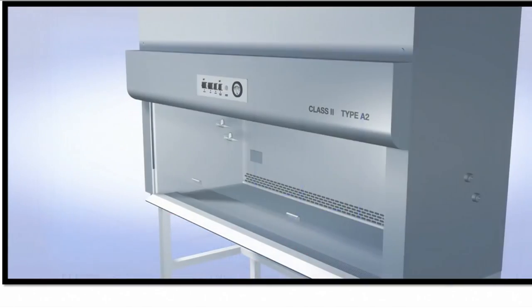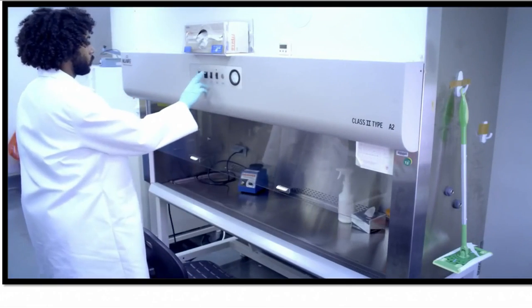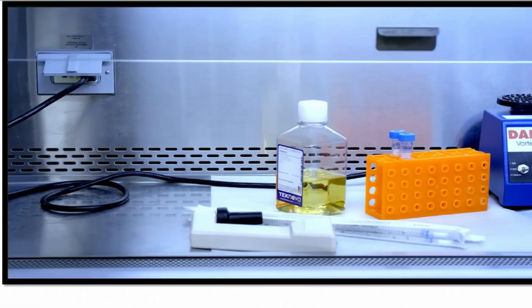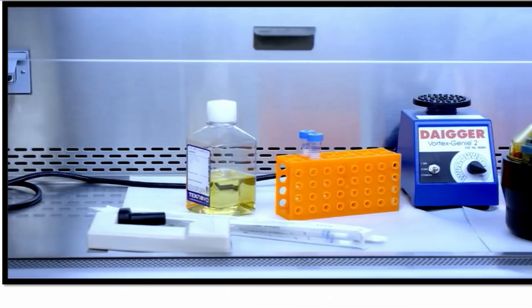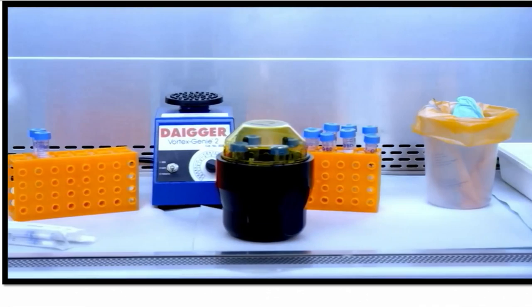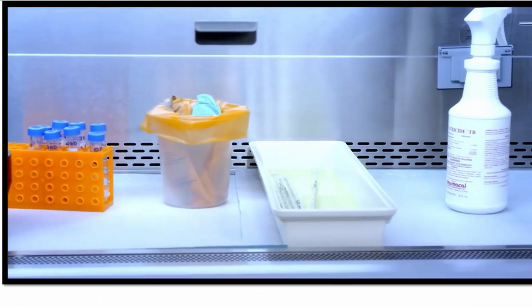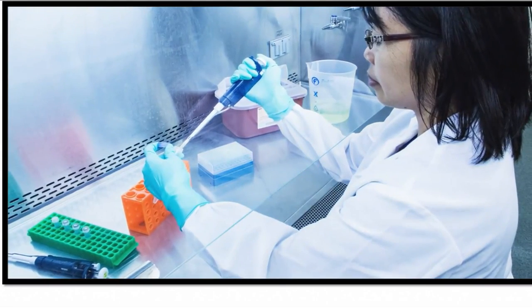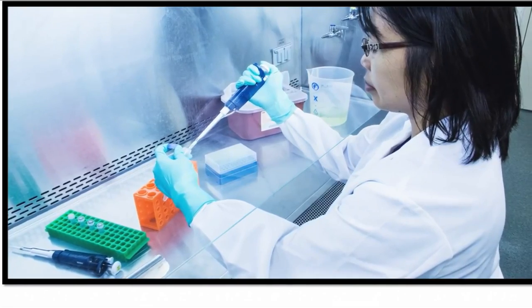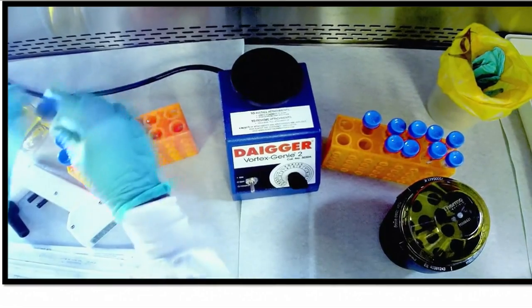1. If the cabinet has been turned off, you must turn it on and wait at least 15 minutes before beginning your work. 2. Set up the interior workspace to work from clean to dirty, and work consistently from one direction toward the other to prevent cross-contamination. 3. Place your chair at a comfortable height and in the middle of your workspace to ensure you can reach everything you need inside the cabinet without discomfort.